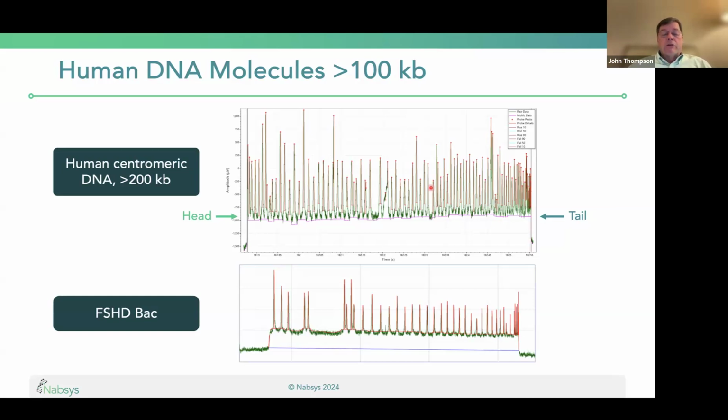Just put in the sgRNA of interest and then just nick it wherever you want. And now you have a new nick site on top of the other ones. And in fact, if you're interested in centromeres that have no nick sites, you can design single sgRNAs that will put in 1,000 or more sites because of the repetitive nature of the DNA. So you can tell the centromeres apart.